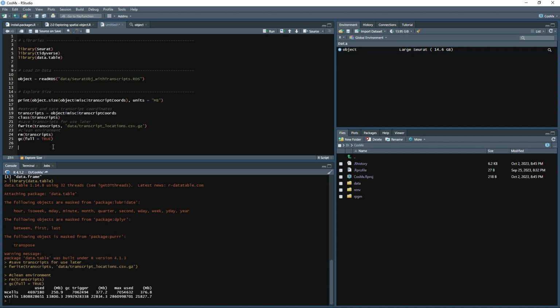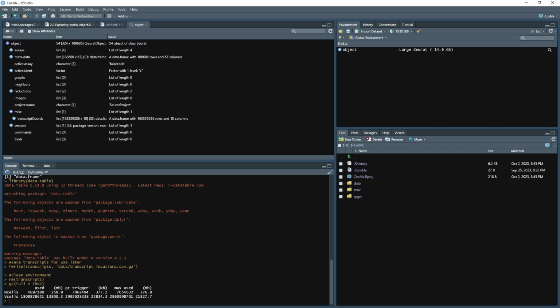But now that we have our transcript saved, there's no use in keeping this object slot occupied by that transcript information, right? So we can remove the transcript info from the object. To do that, we have to check the object type.